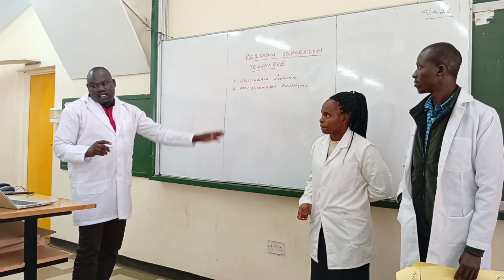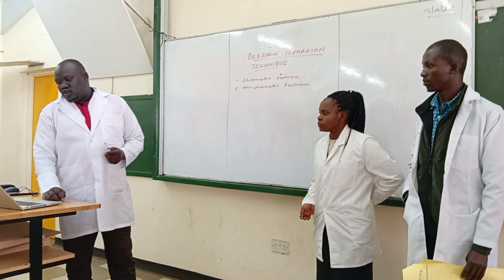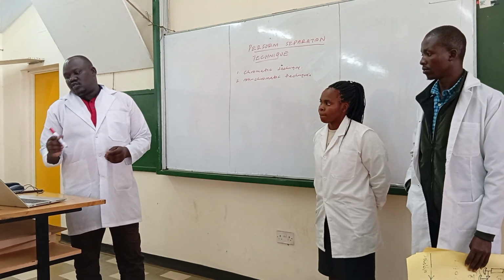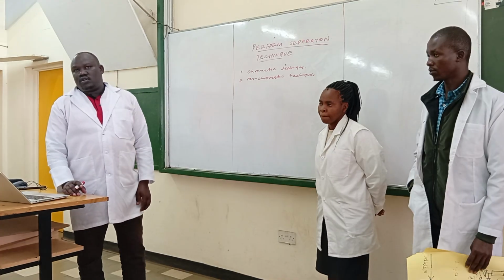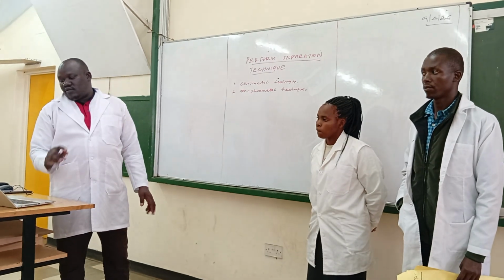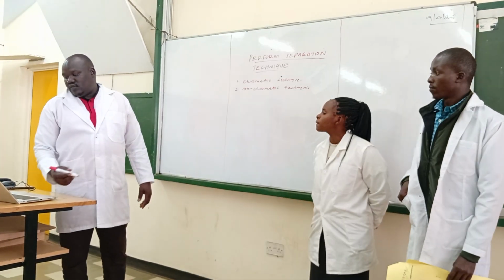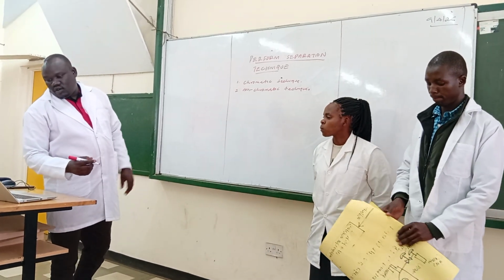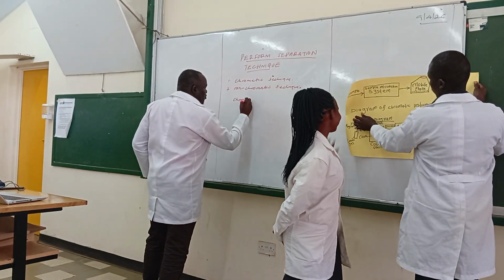And then for non-chromatic techniques, they do not rely on phase interactions. These include filtration, distillation, and centrifugation. Okay? So next, there are the components of the chromatic instrument, which we are now discussing.